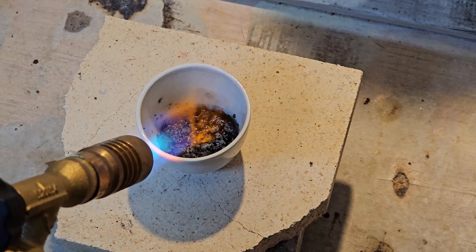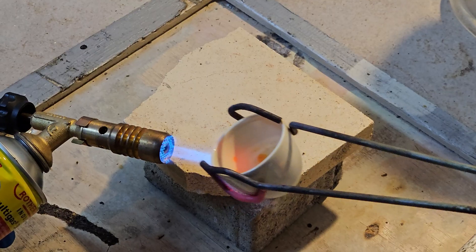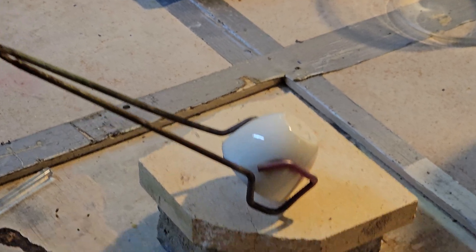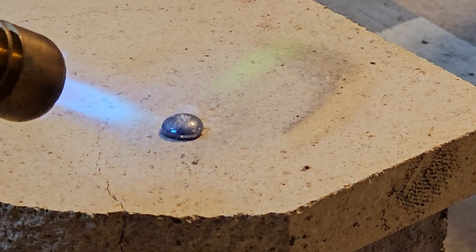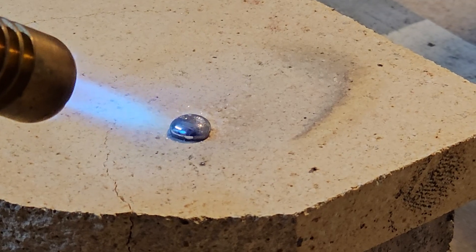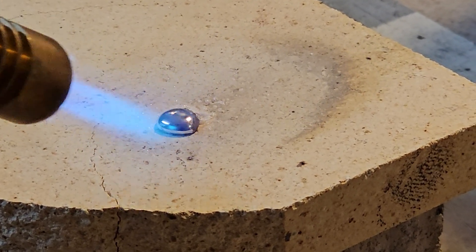This unexpected result led us to reassess the representativeness of our initial analysis, considering the possibility of sample variability within our larger ore collection. The remaining solution was treated with sulfuric acid to detect any residual lead, but no precipitation occurred. Similarly, re-dissolving the filter cake in nitric acid revealed no trace of lead, suggesting that our initial 126g sample might not have been as rich in lead as others in the collection.